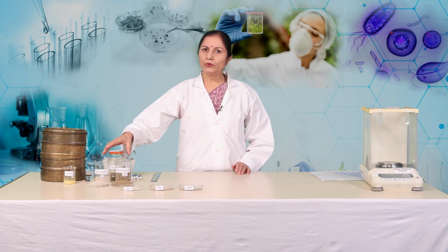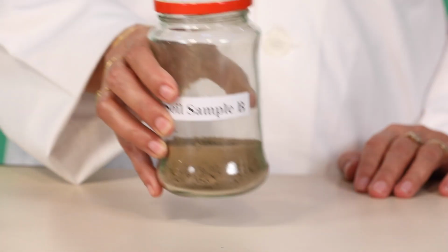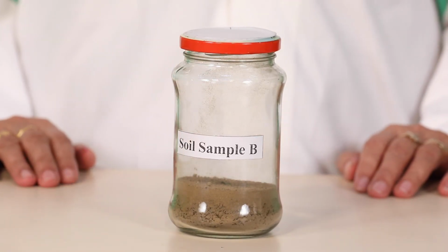Now, let us understand second method which is called mason jar method on soil sample B. Dry the collected soil sample B. Take about 100 gram of soil sample B in a glass jar and pour 180 ml of water in it.